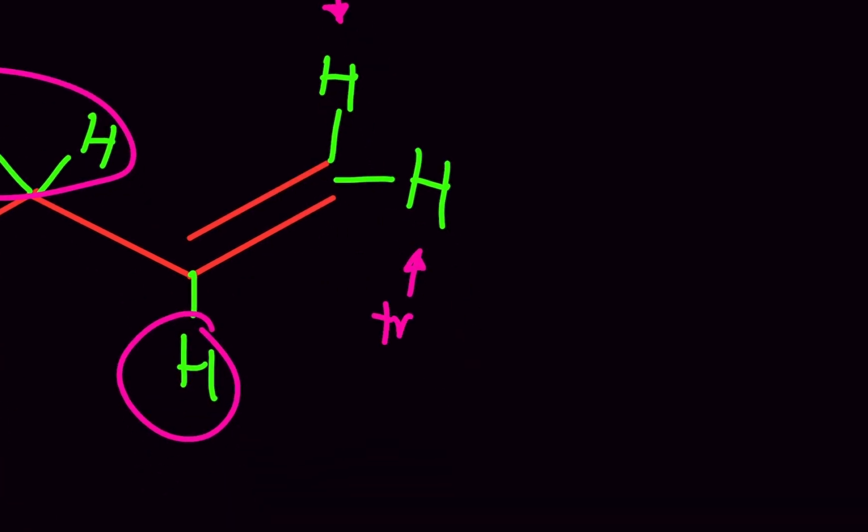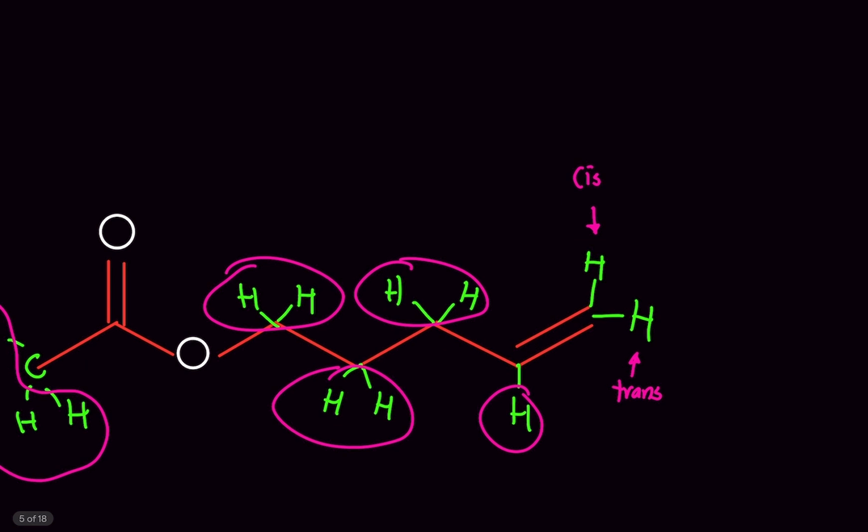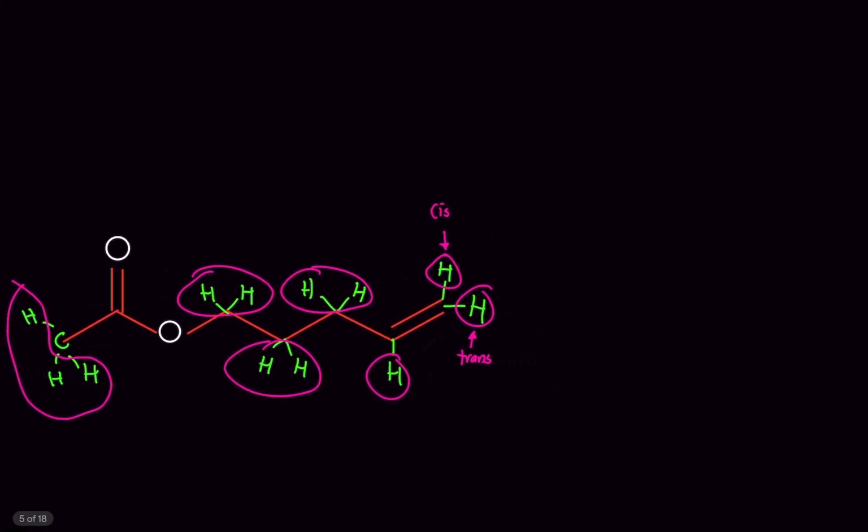Now, if this is too complicated, what I suggest is think about it like if you see a double bond here, most of the time, they're going to be different environments. Okay? So, we circle this and circle this individually. This means, and we have no symmetry whatsoever in this molecule. So that means that all the circles are going to remain as it is. No joining groups. So you have 1, 2, 3, 4, 5, 6, 7 signals. Okay?